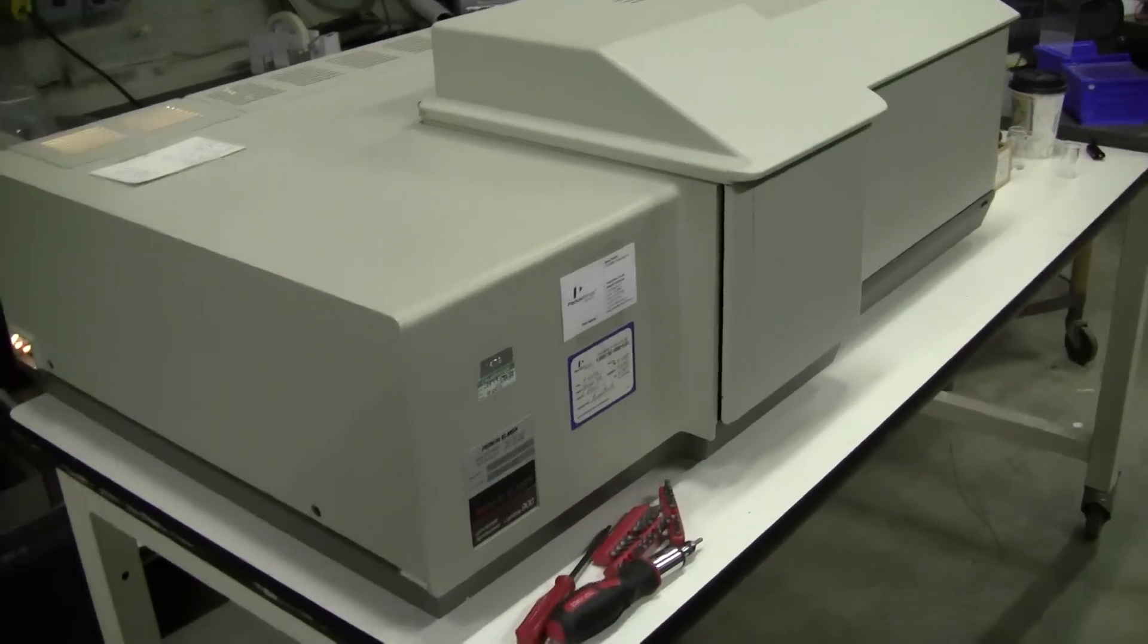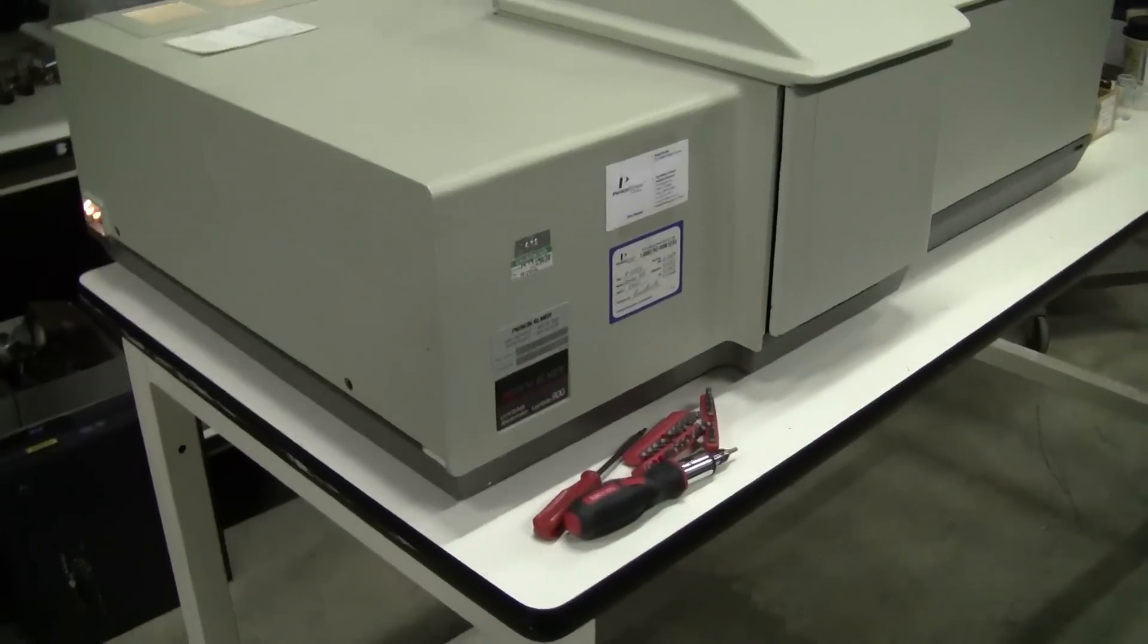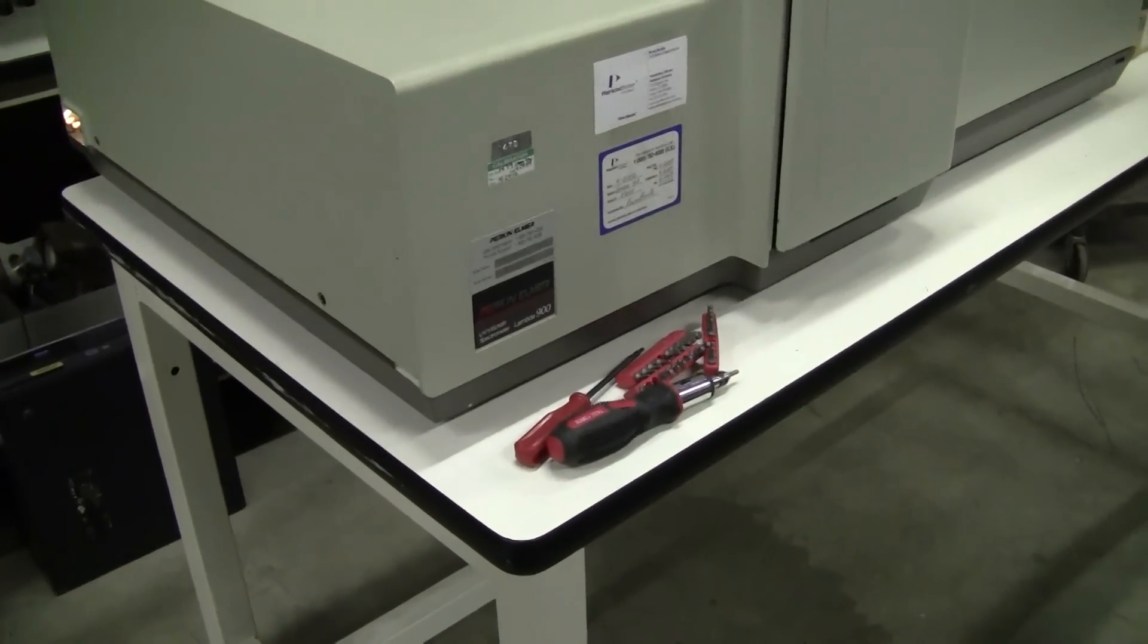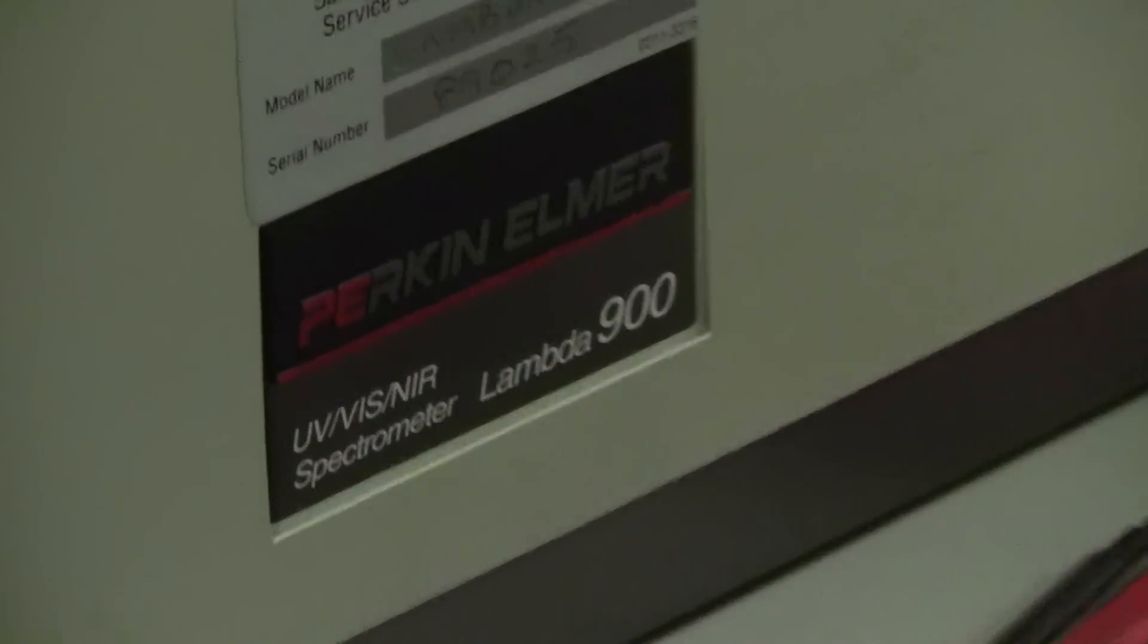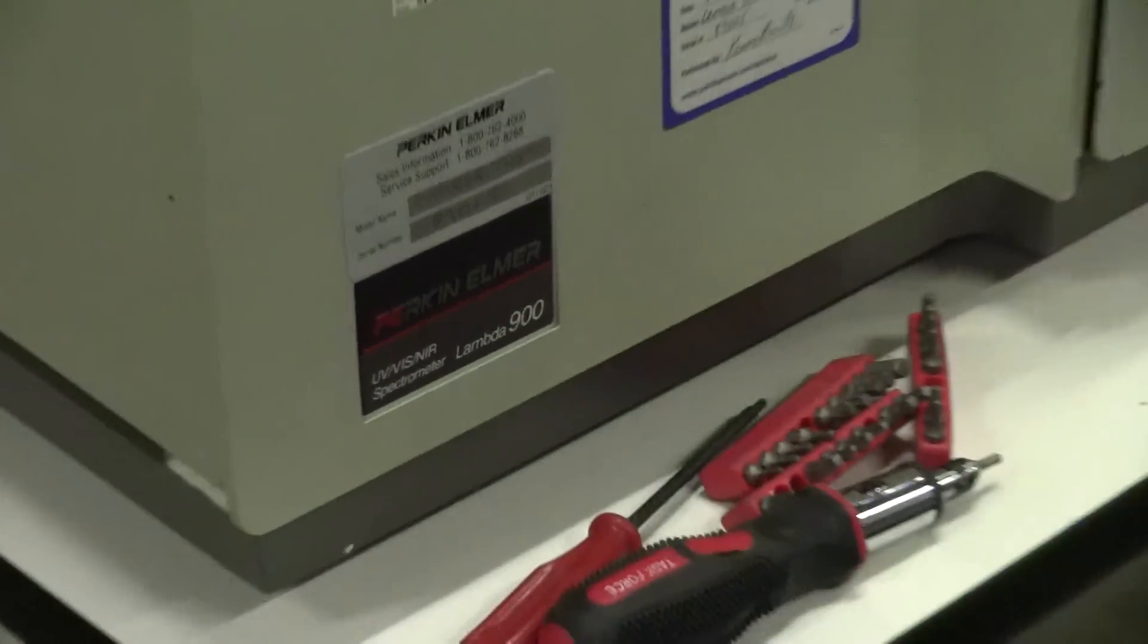Hello, this is Michael Nathau from Hitech Trader. Today we're looking at a Perkin Elmer Lambda 900 UV-Viz Near-IR spectrophotometer.